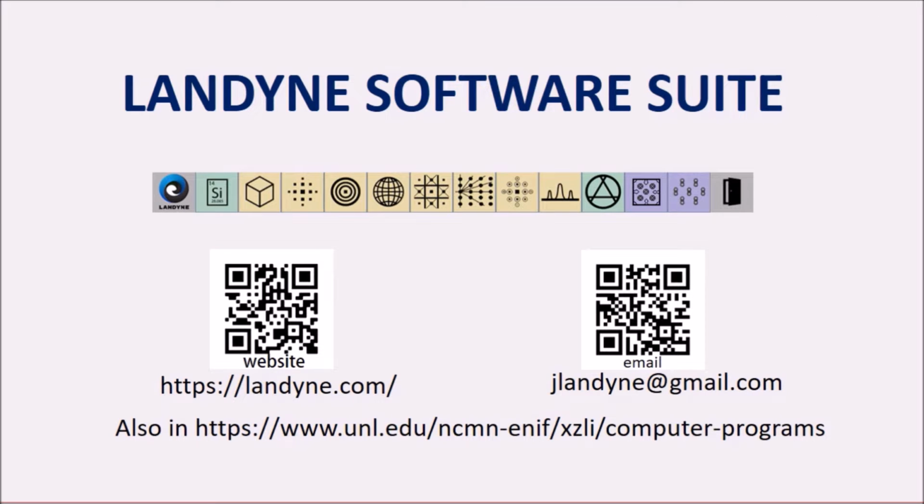In this tutorial video, I will introduce PCED, a computer software for polycrystalline electron diffraction simulation and phase identification. This is one of the main components in the Landyne software suite for electron diffraction simulation and crystallographic analysis. You may download the software suite, including user manuals, from the website on the screen.